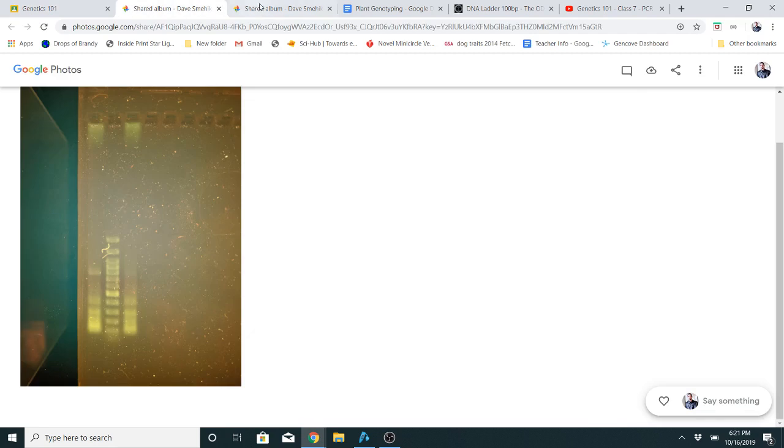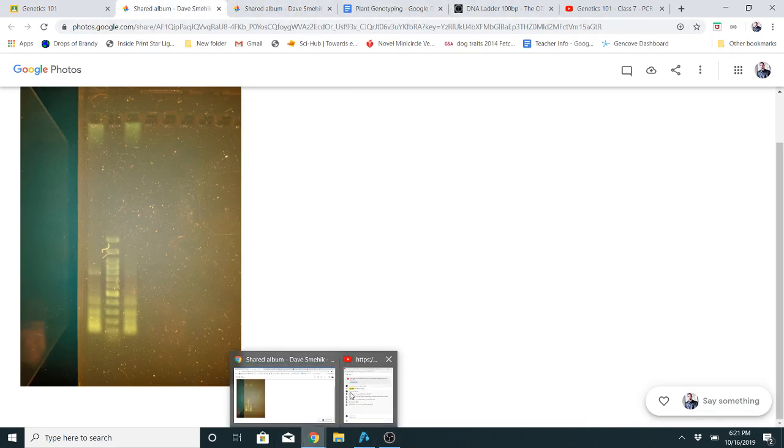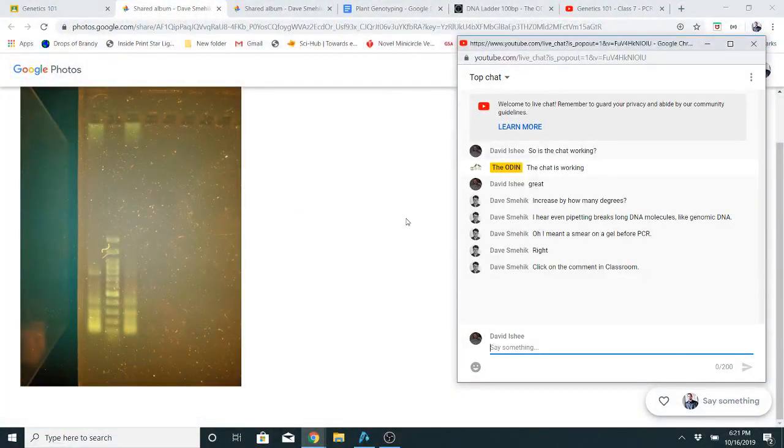So did you add RNase after PCR? That'll pop up in a minute. There's a pretty good delay between me and the stream. But just put in the thing whether or not you added RNase before or after, or if that's just the template you used.